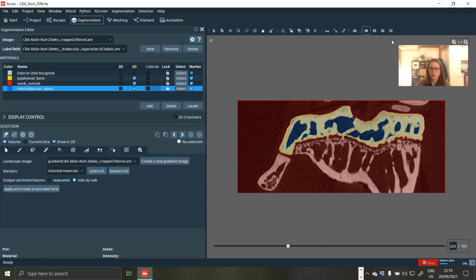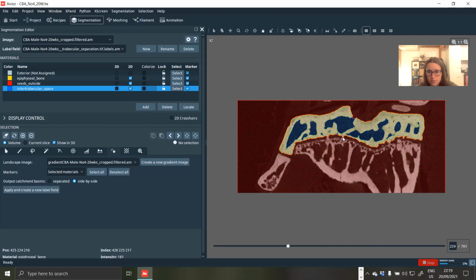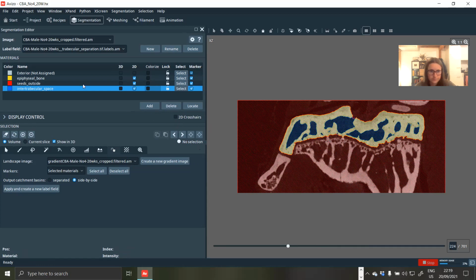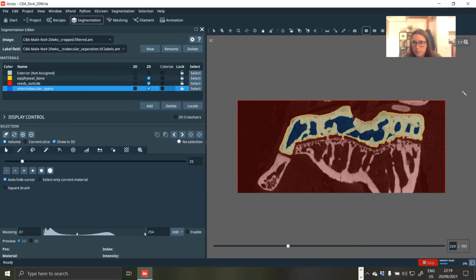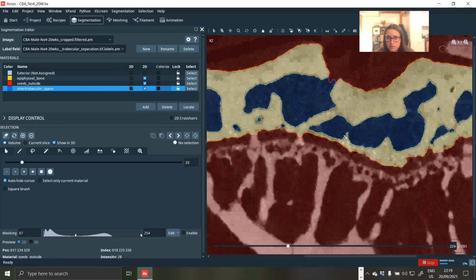For example, again, I didn't save this version, but with the watershed, sometimes initially it'll include some of the growth bridges, and then you can go back and add some more seeds. The way we do this iteratively is, if there was a region, say here, where we wanted to get a lot more detailed, say we really wanted to get rid of this area, we would select it like this, still on the watershed output, because there we can really see what the result is.